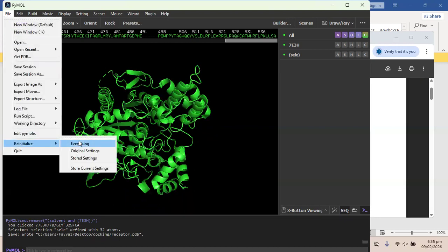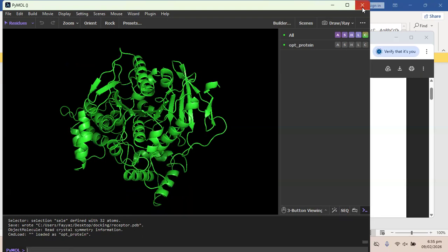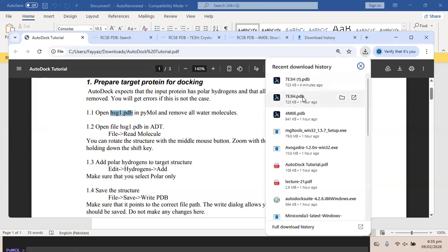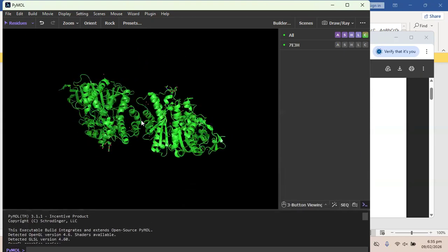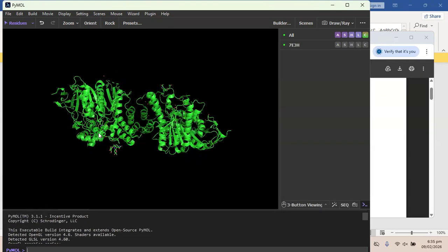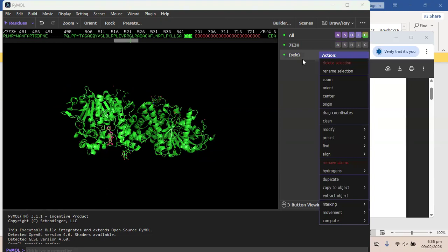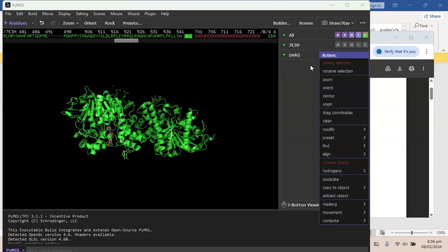One other thing I want to show you: I will reopen my file here. If I want to extract only the ligand molecule, E20, which we want to use as a ligand, I will go to this particular thing, and here you can see that whenever I select something, a selectable item appears here.